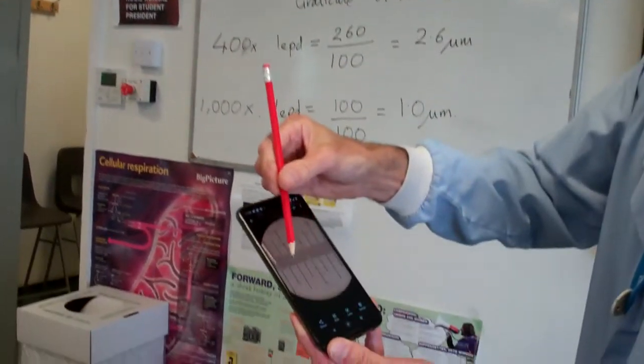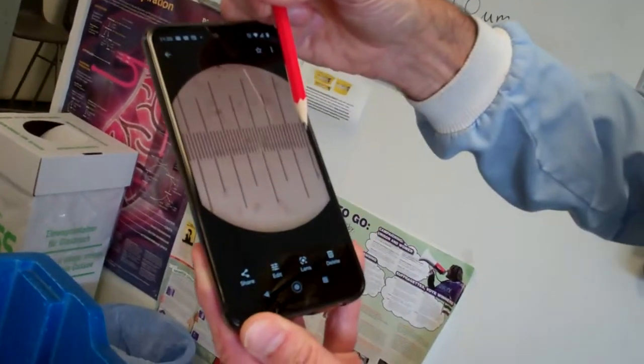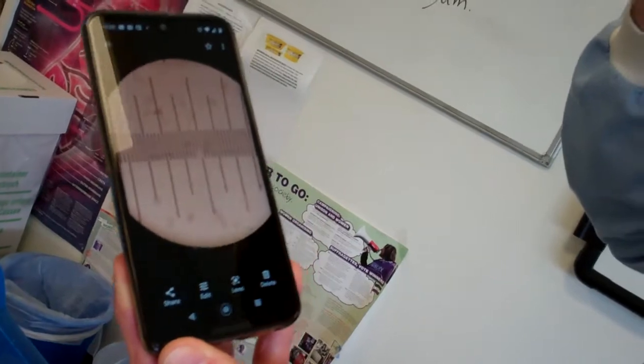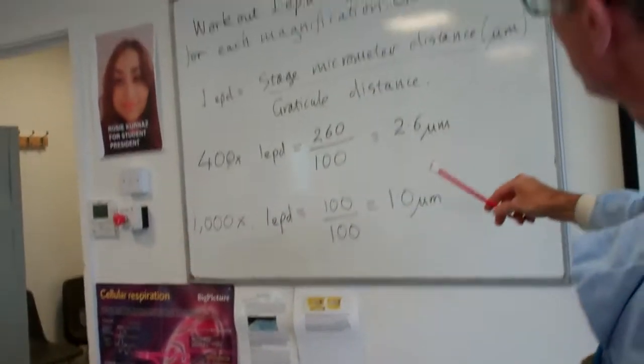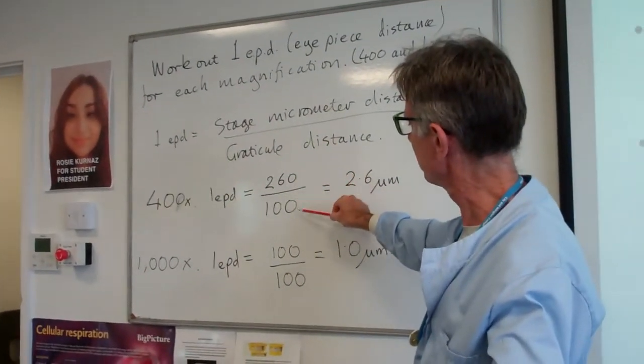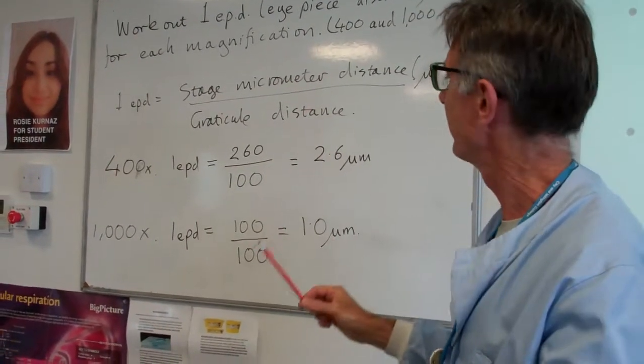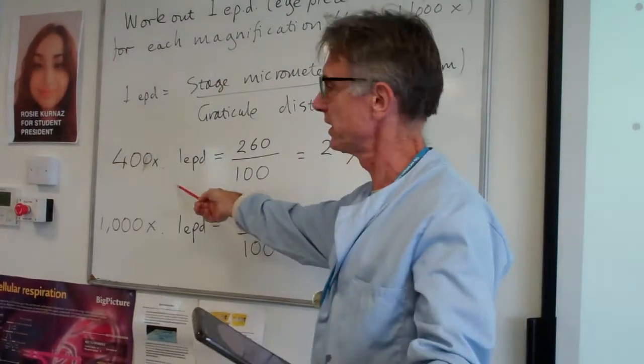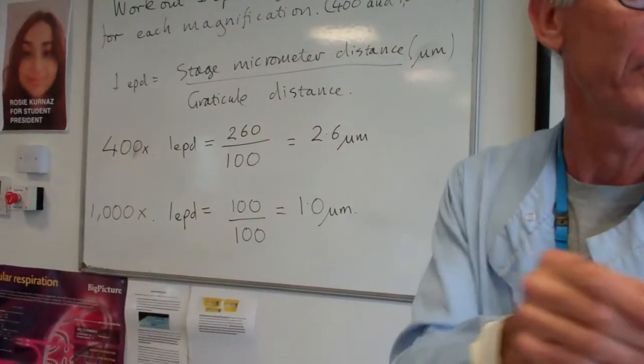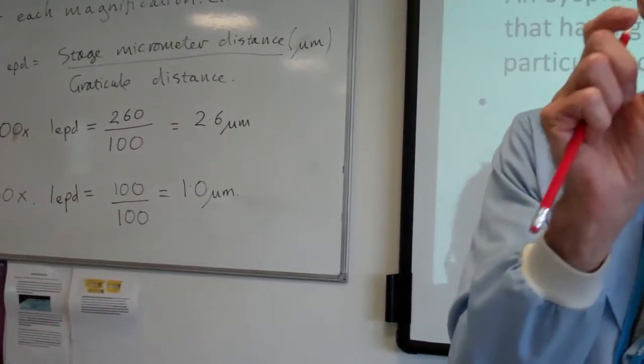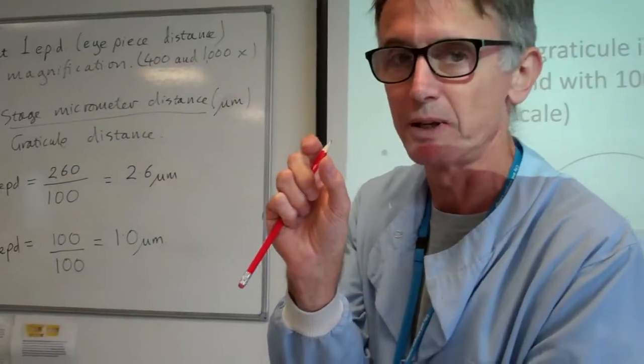I know that 0 to 10 is actually 100 divisions on the eyepiece. So this is simple math: 260 divided by 100 equals 2.6 micrometers. What that means is, at 400 times magnification, when I'm looking down this, each little division is 2.6 micrometers.